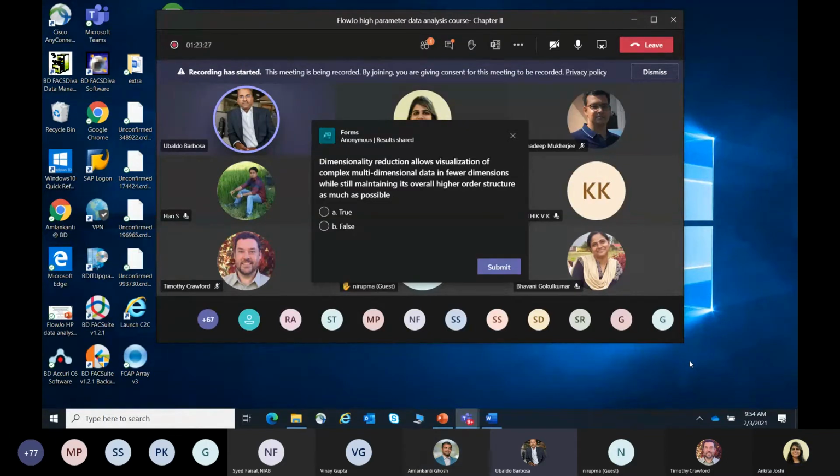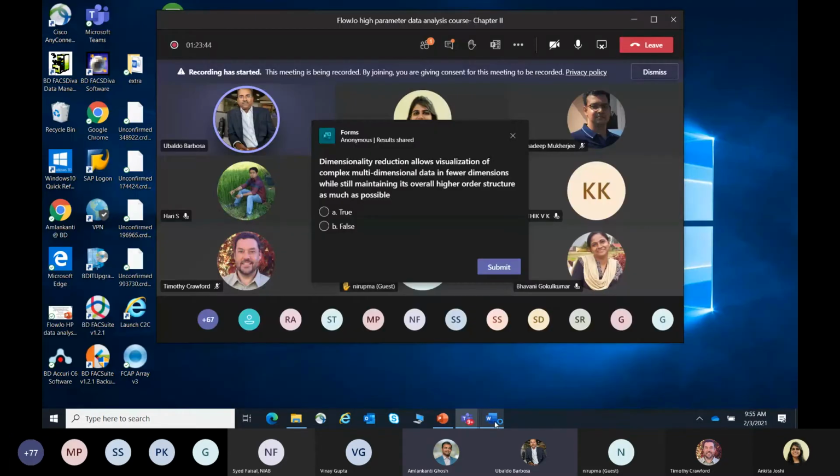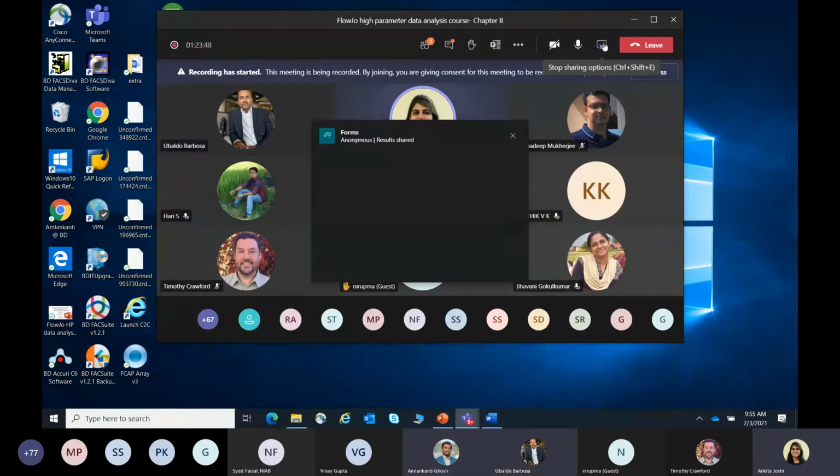So is this the third question now, Ankita? I believe it is the second one. Or second, everybody's answered perfectly, looks like, right? Okay. The answer would be true. Yeah, so I think almost 100% of the people have said it's true. So I've already seen that. Yes, now I've shared the third question as well, sir, because we were having discussion. Yeah, it's live now. Okay. And is that the last question before we move back? Right, sir. Yeah. Okay.